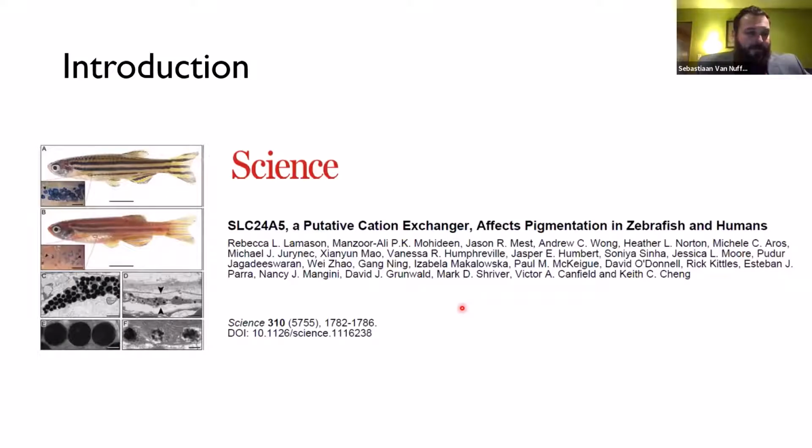Now, what you really need to do to prove that you're knocking out this calcium exchanger is to have a look at the calcium concentration in tissue that is rich in melanosomes, for example, the retinal pigment epithelium in the eye. X-ray micro-CT, however, is not capable of chemical imaging. It's very good at three-dimensional volumetric imaging, but not chemical imaging.